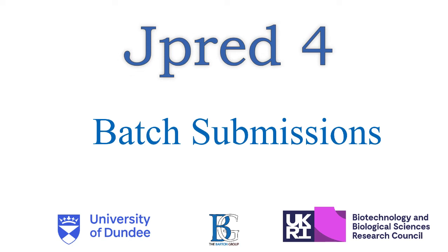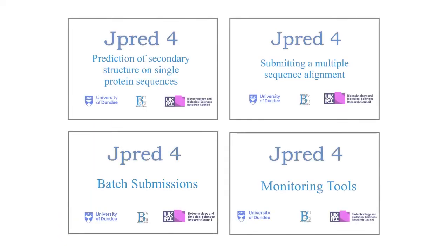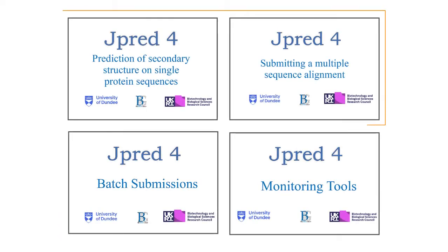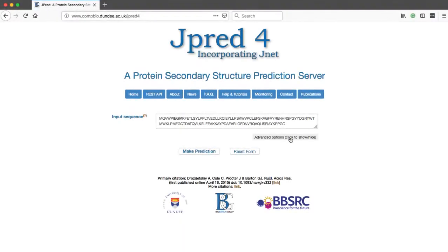This video demonstrates how to use JPRED 4 to make batch submissions of several sequences for predictions. The previous videos explained how to run JPRED 4 in single and multiple sequence alignment modes. The JPRED website can be accessed using the URL on the screen.